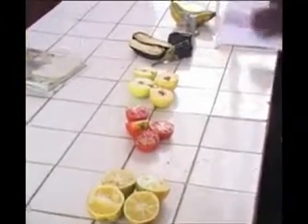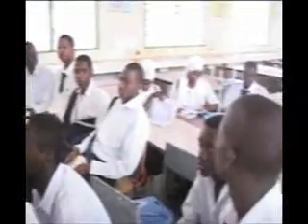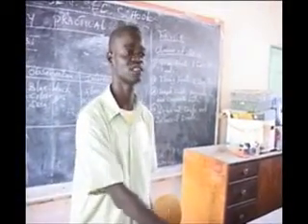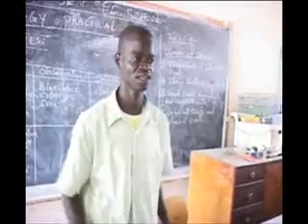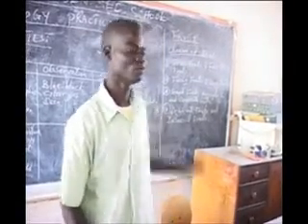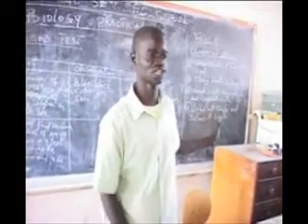of fruit. If you look at the table, we have two apparatus on those two tables, which is going to talk about food tests, the three types of food: protein, carbohydrates, or starch, and then fats. We are going to test them. And then secondly, we are also going to discuss these fruits, which I have just displayed on the table here. So to start with, we have already learned about food tests.